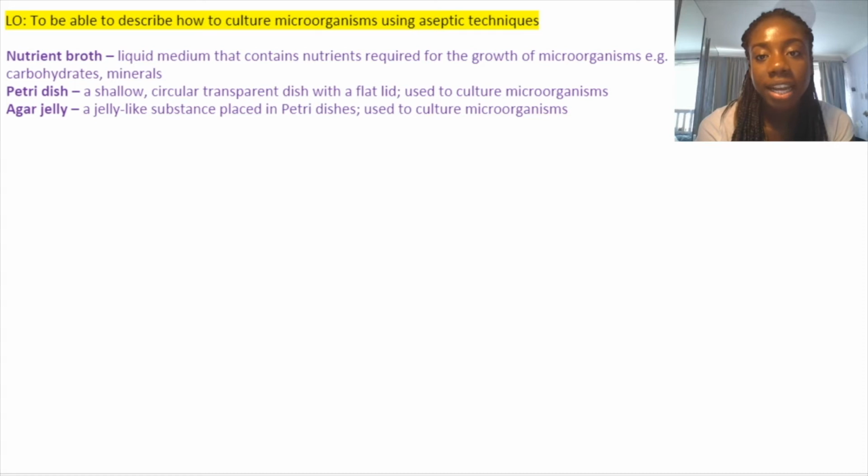All the information in this video also relates to a required practical, which is on your spec, which is basically the same thing, culturing microorganisms using these techniques. And this video will tell you why each step in that experiment is important and how that relates to the biology of bacteria.